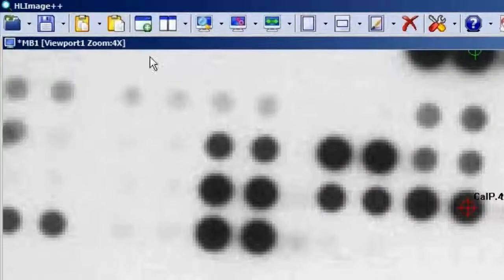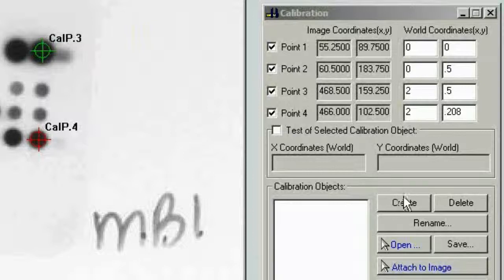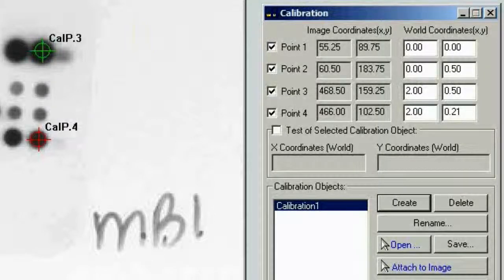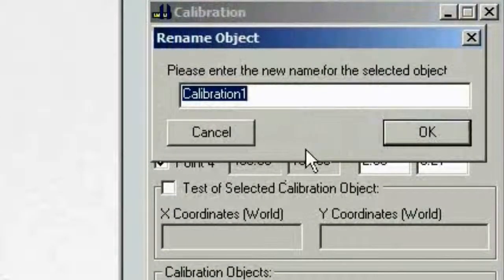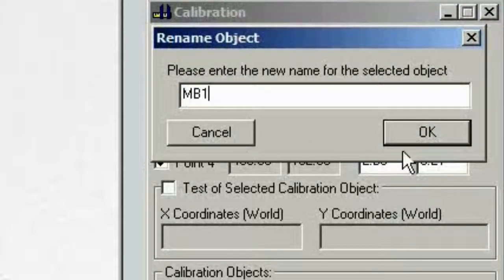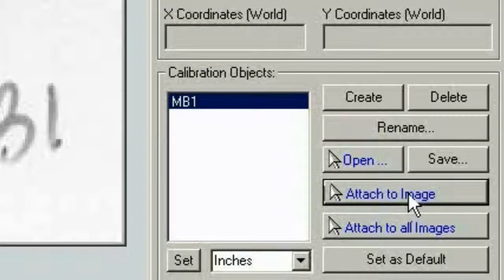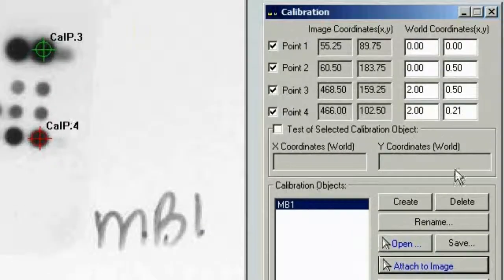We'll go back to a zoom level of 2. Now that our points are centered as well as we can get them visually, we simply click create calibration object. The calibration object is the item that actually transfers image coordinates into real-world coordinates. Because our image is named mb1, we rename the calibration object to mb1 as well. Once created, we attach it to the image — a very important step, otherwise things won't work. Don't forget to click attach to image. Now we can close the calibration tool.